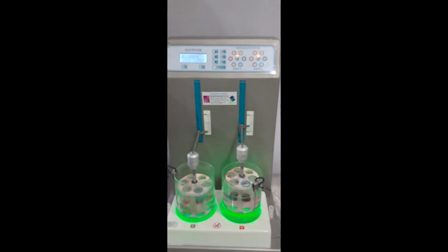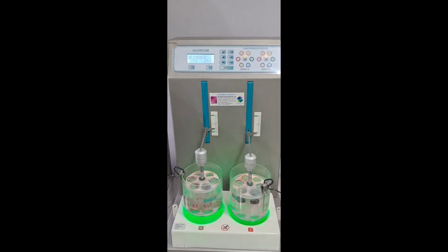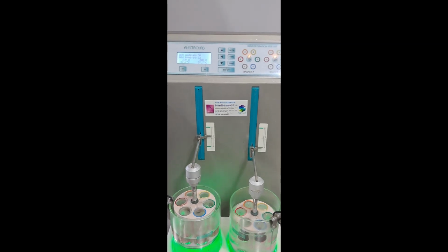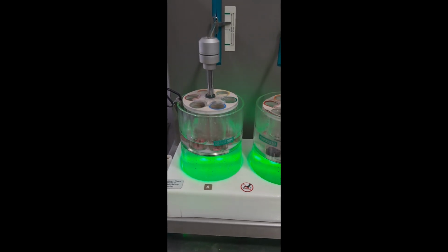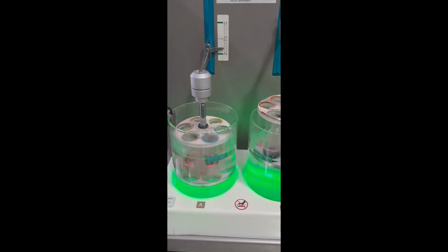8. Data logging and endpoint determination. Use automated timers and alarms where possible to reduce human error. Standardize the visual or video-aided endpoint check. No bits greater than 2 mm remain, only soft masses.